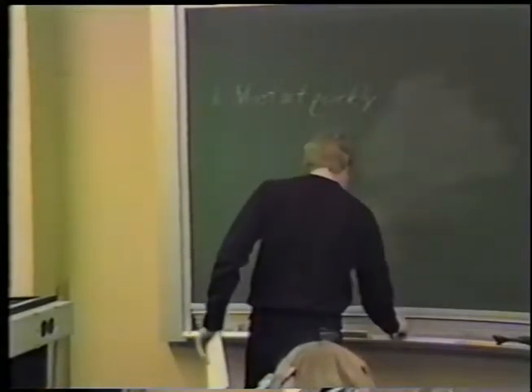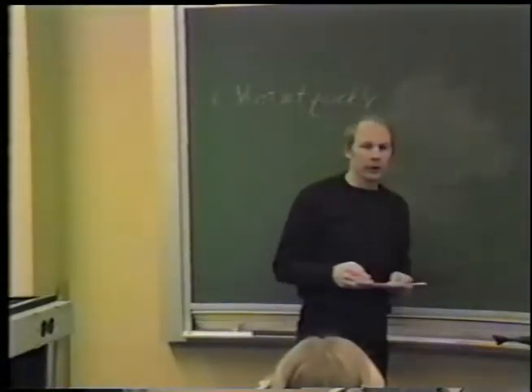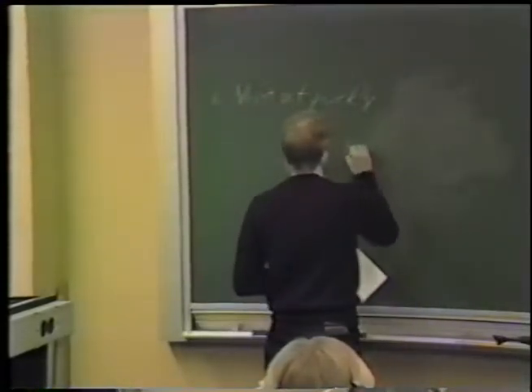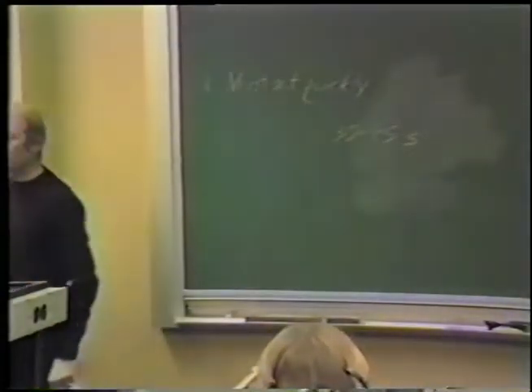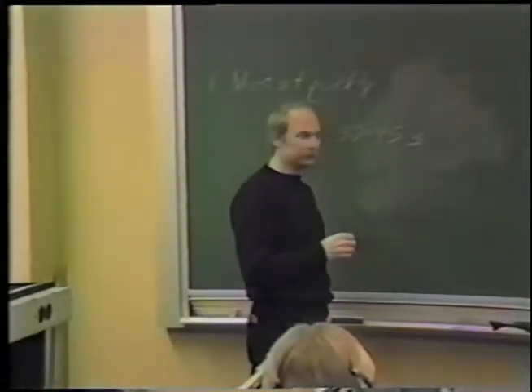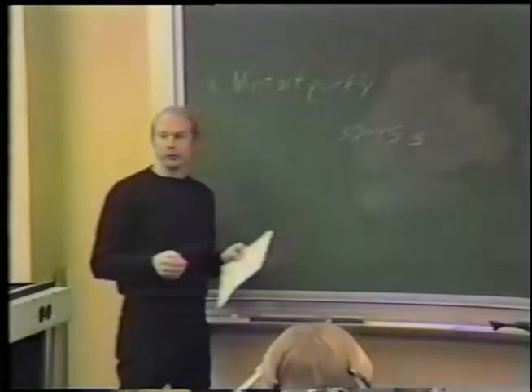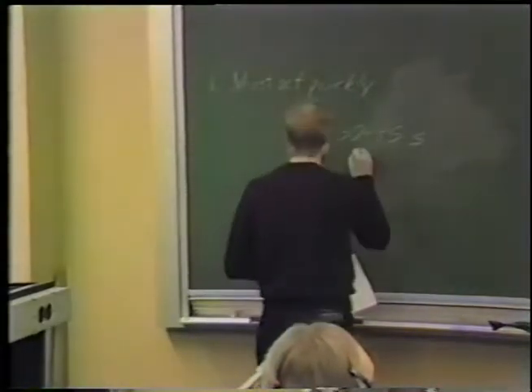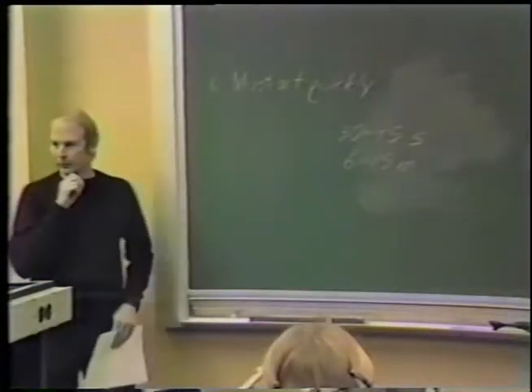There have been some actual light microscopic observations made of the time required for glutaraldehyde and other fixatives to immobilize cytoplasmic inclusions. It seems that 30 to 45 seconds are required to immobilize cytoplasmic inclusions in cultured cells, not large objects, very thin cultured cells. And other workers have found in cells that exhibit vigorous cytoplasmic streaming, such as metaphyte hair cells, that various combinations of fixatives require 6 to 15 minutes to immobilize all cytoplasmic inclusions.